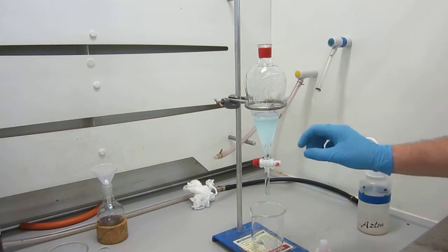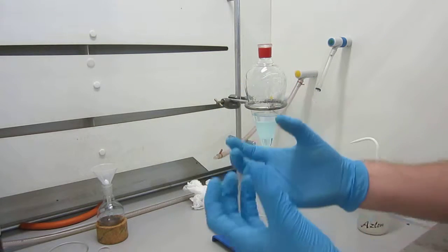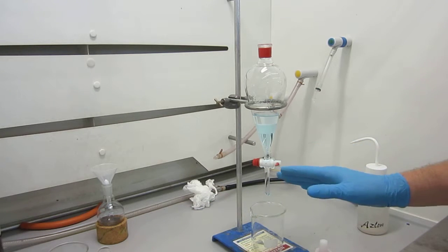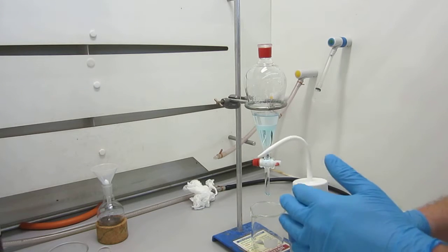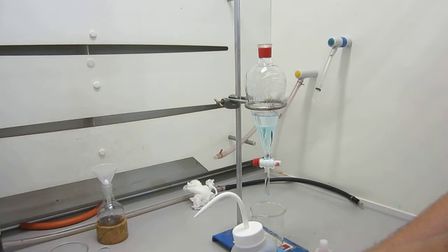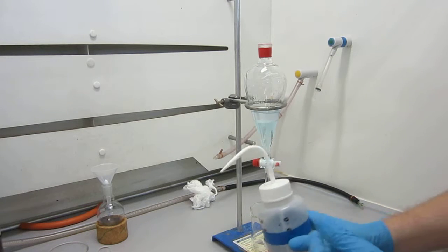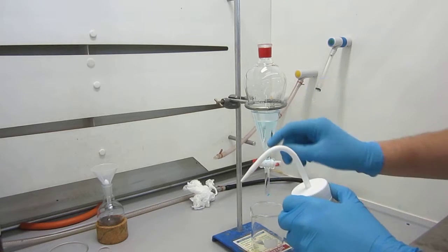Sometimes you may struggle to get the layers to separate. If you've got a lot of product in there, the product can work as a kind of surfactant and hold the layers together and form what looks like an emulsion. To break that down, you can just add more of one or both of your solvents. So I'm extracting with 3 times 25, but it's perfectly fine to just add more water in if I need to. Or if I'm not sure which layer is which, I can add more of the one solvent and see which layer it goes into.